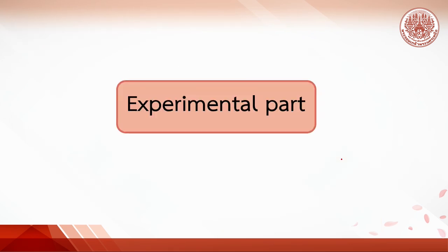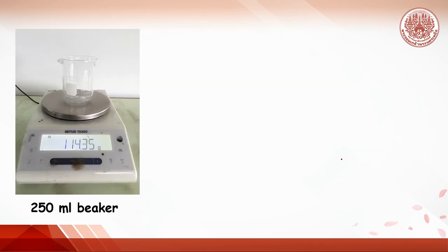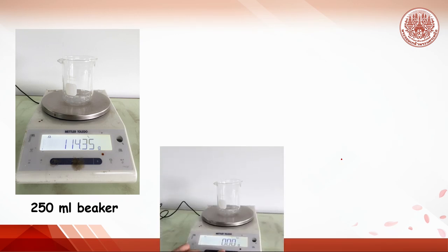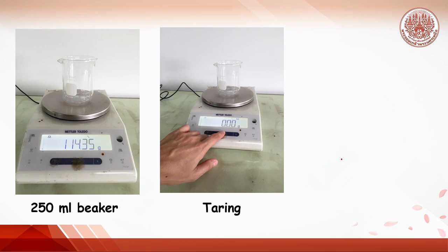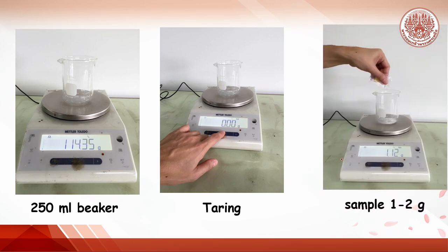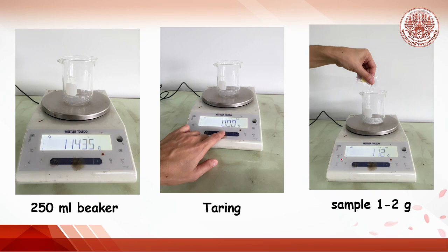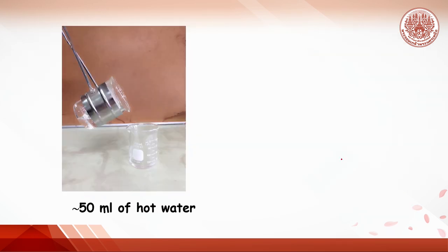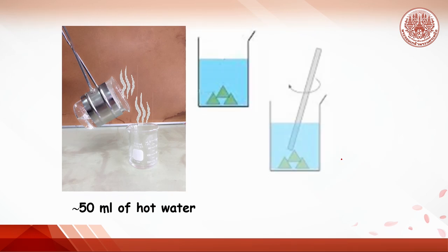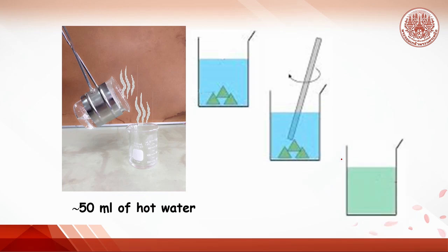We will start step by step. First, press a 250 mL beaker on the balance plane. Push tare button to offset the beaker to zero. An unknown sample is added about 1 to 2 grams and record the exact weight. Then, 50 mL of hot water is added into the beaker containing sample. Stir to dissolve the sample until clear solution is obtained.